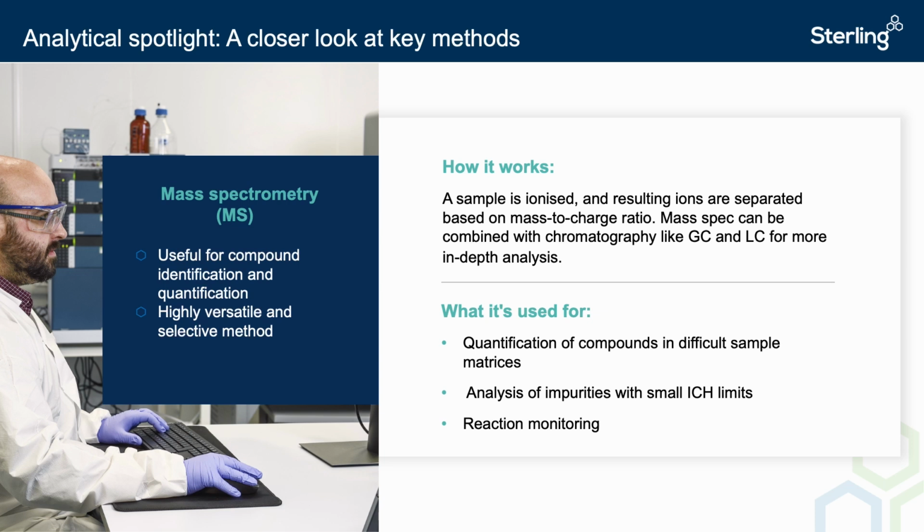This can be useful in separating the target compound from a complex matrix by selectively scanning for the mass-to-charge of interest and sending the rest of the sample to waste.